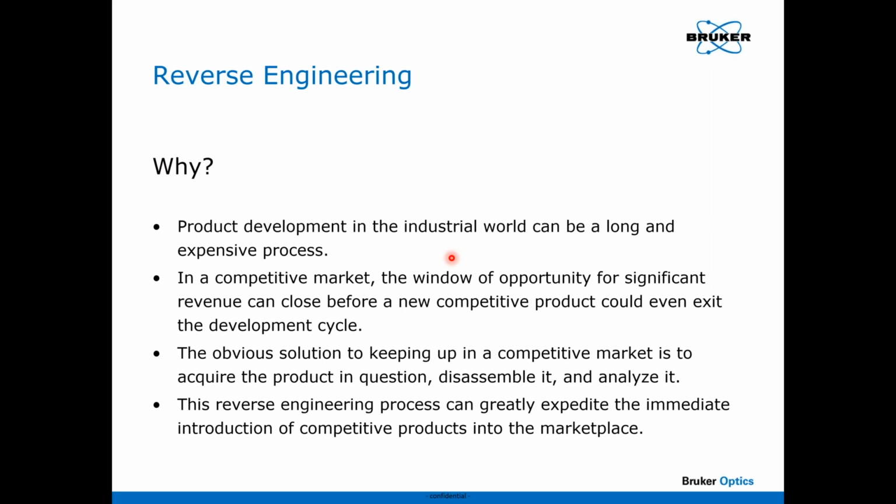And the focus of this webinar is looking at reverse engineering. So why reverse engineer a product or an object? As Lauren stated, I am involved with analyzing art objects directly and indirectly, and in many other fields of study as well. So the common denominator really is looking at how molecules interact with light. That's what a molecular spectroscopist does. We look at how molecules interact with light.